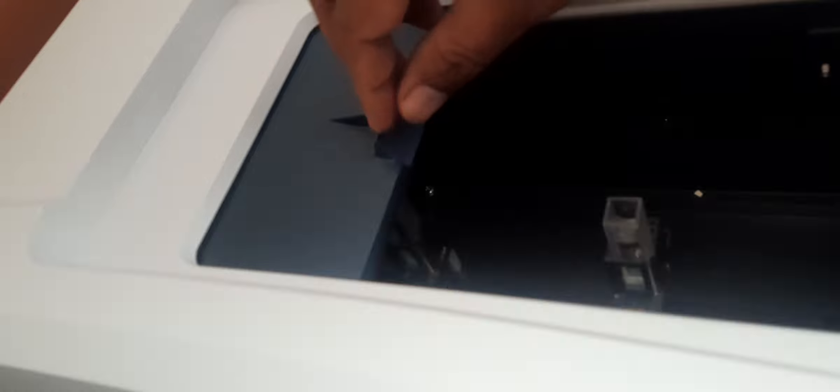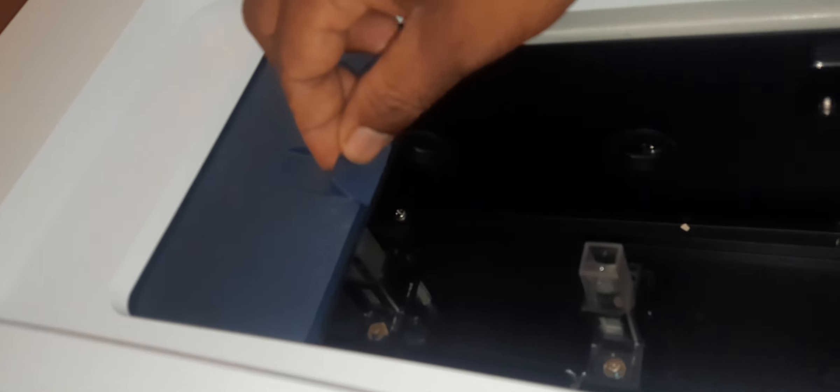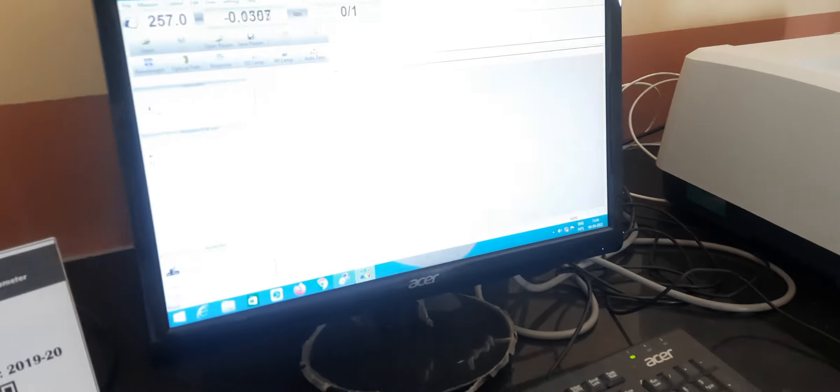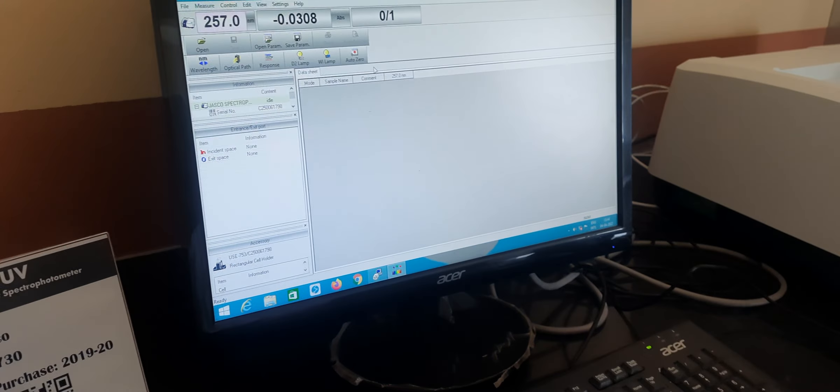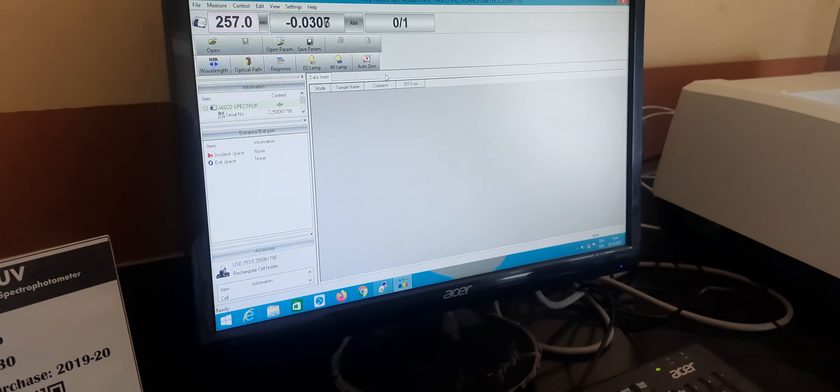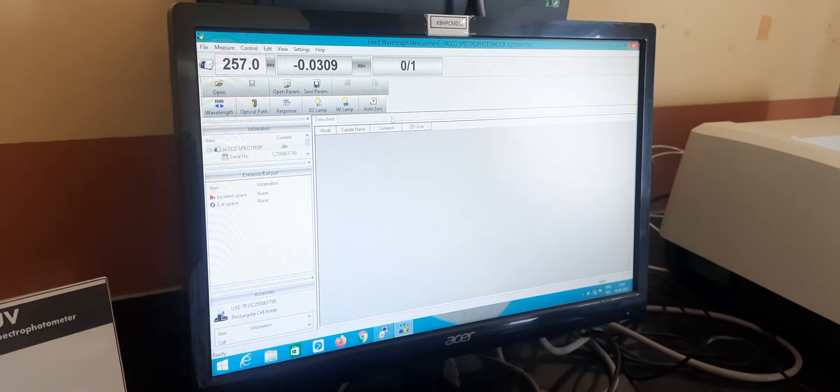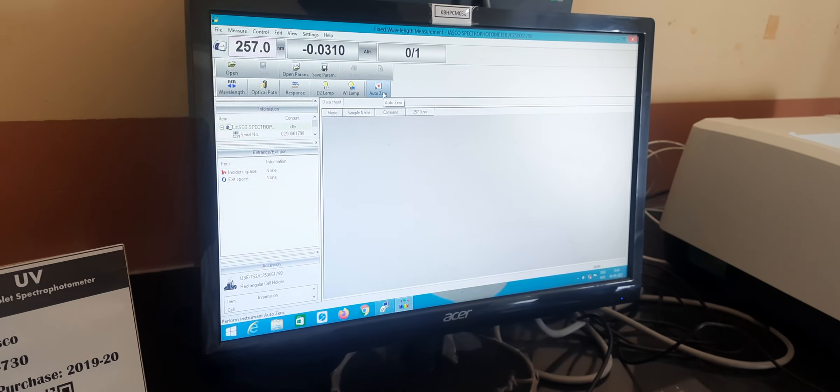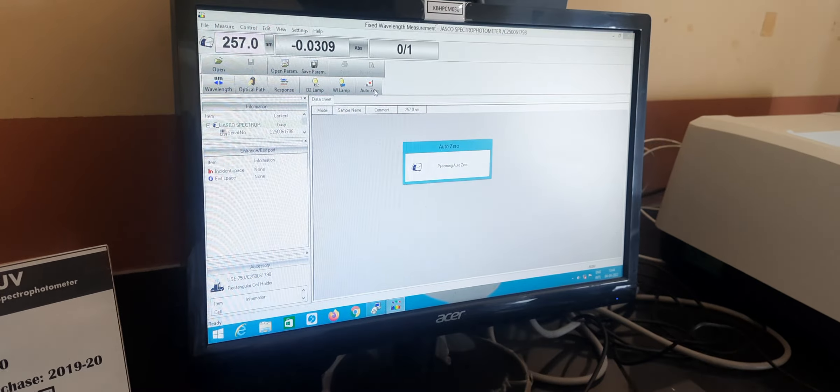Place the solvent in both cuvettes, the same solvent we're using for dilution. After that, just click on auto zero.